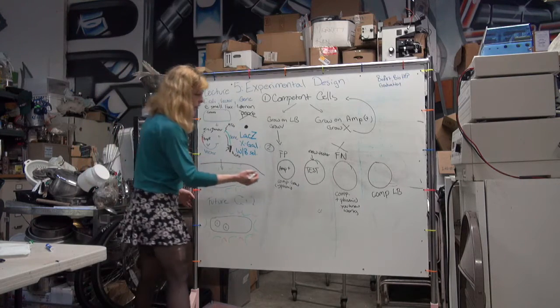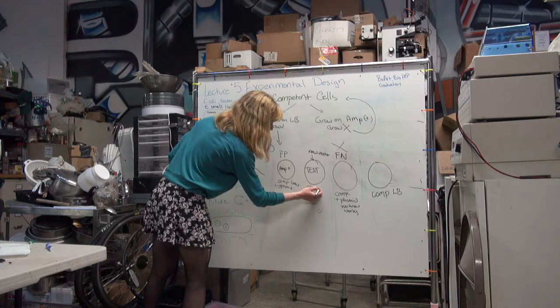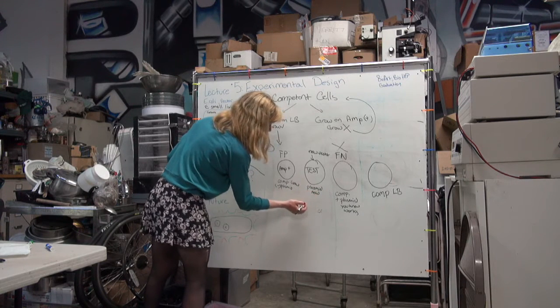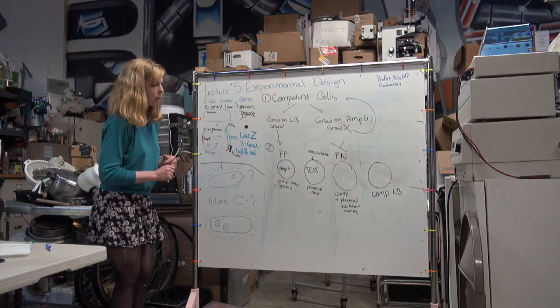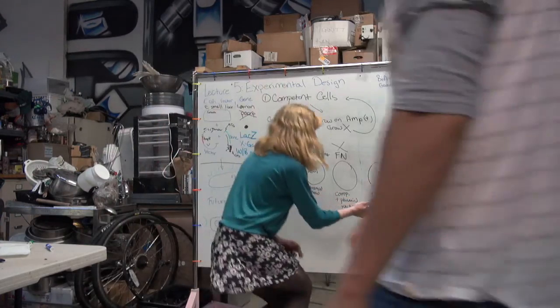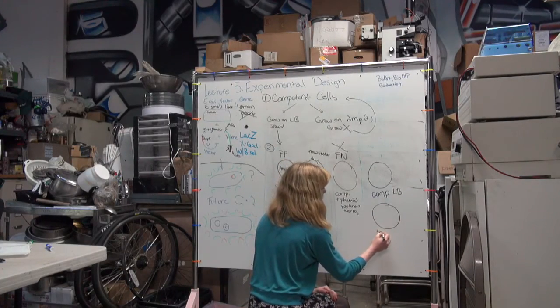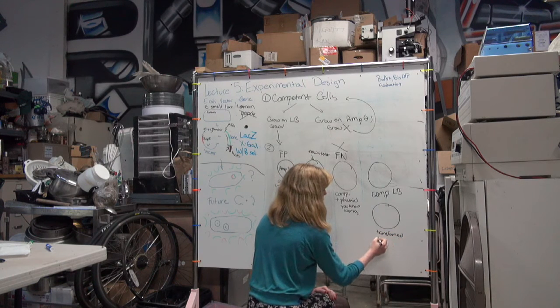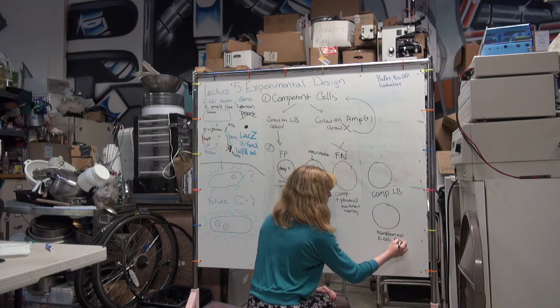And so this is one. This is just a transformed E. coli that is AMP-resistant positive.